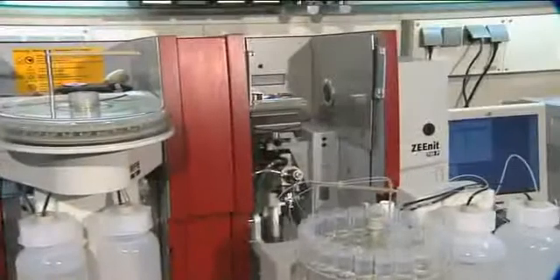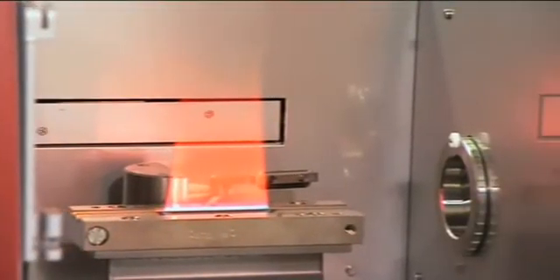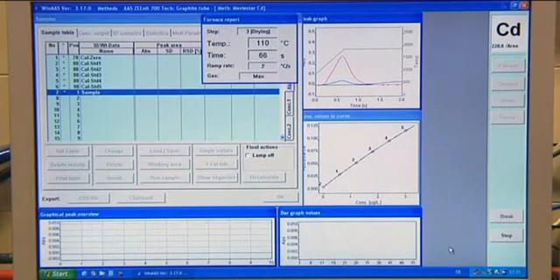The Zenit 700 Atomic Absorption Spectrometer is a combined flame and graphite furnace system of the most recent generation. It is easy to handle and operate, its analytical performance is at the highest level, and it represents one of the most mature tandem AAS instruments of its kind.